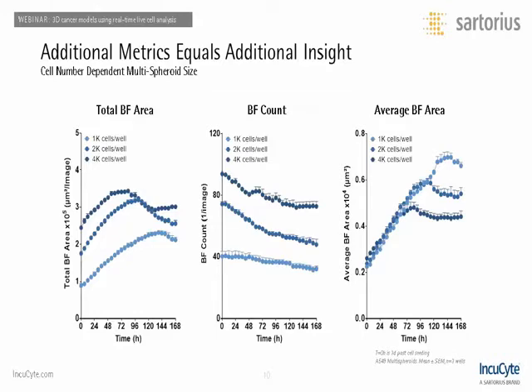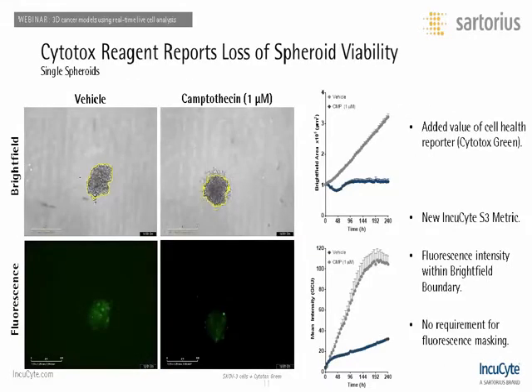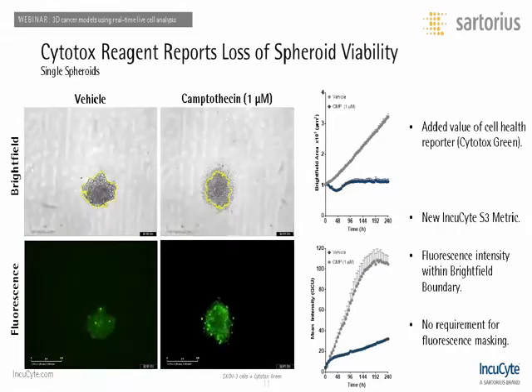I think you'd agree that this type of matrix or validation experiment described, with these associated metrics, allows you to easily define final assay concentrations accordingly. For example, knowing what seeding density to use if you wanted to minimize the impact of merging in your experiment.